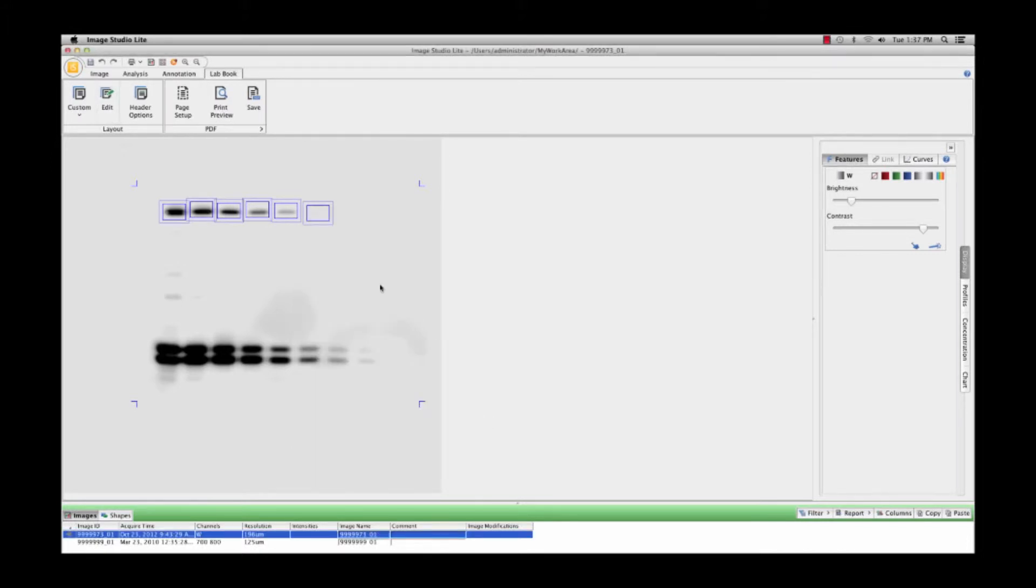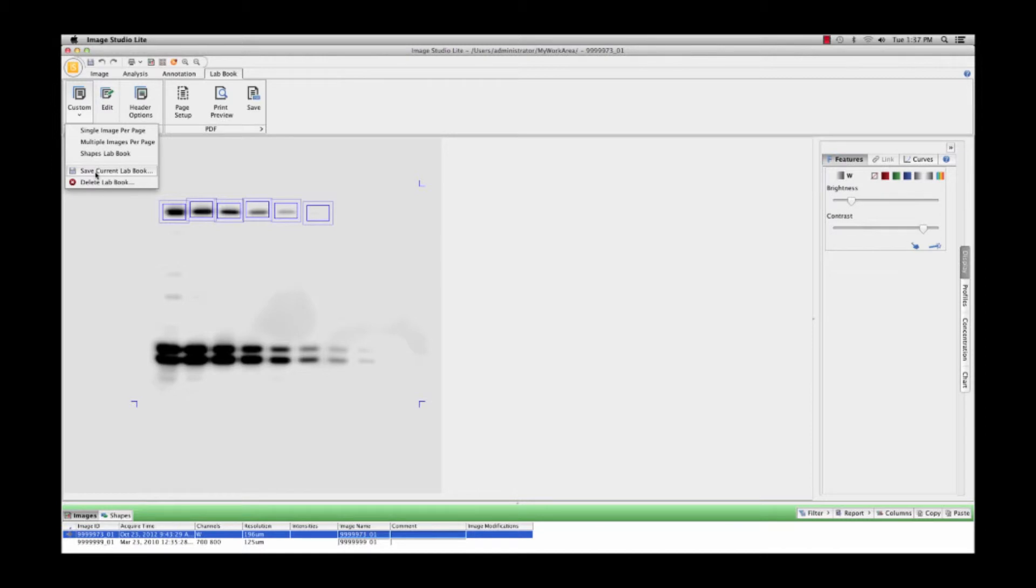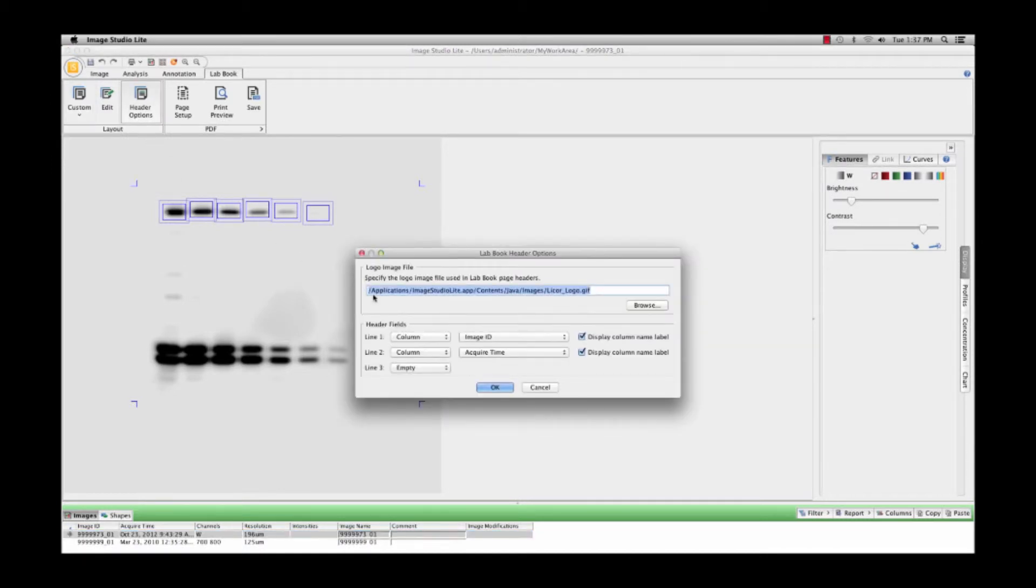Custom layouts can be saved for future use by selecting Save Current LabBook and entering a new name. LabBook headers can be customized using the Headers Option button.